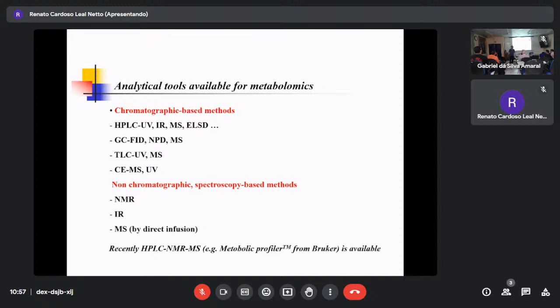Now, you have a big pharma producing tablets every day, but you want to know which ones are outliers. This is very important, otherwise it will cause a lot of problems. Should I use LC-MS? It takes 1 hour per sample. Or NMR? No. So just scan the fingerprint by IR. Or sometimes you use Raman spectroscopy, which is a vibration method. IR is also a very robust signal.